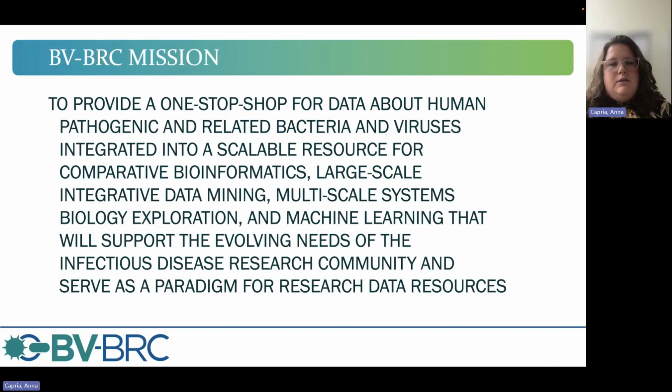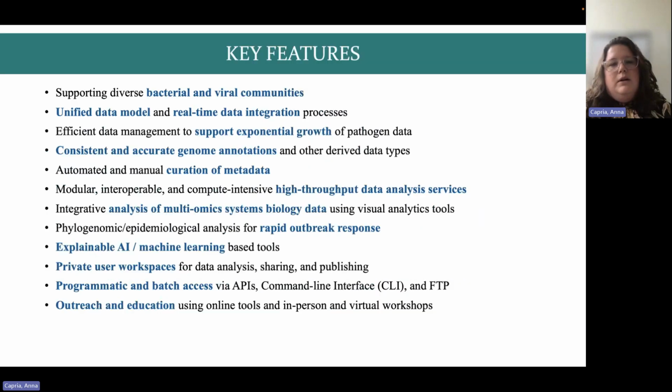So our mission is to provide a one-stop shop for data about human pathogenic and related bacteria and viruses, integrated into a scalable resource for comparative bioinformatics, large-scale integrative data mining, multi-scale systems biology exploration, and machine learning that will support the evolving needs of our infectious disease research community and serve as a paradigm for research data resources. And how we embody that goal is when we start thinking about our key features.